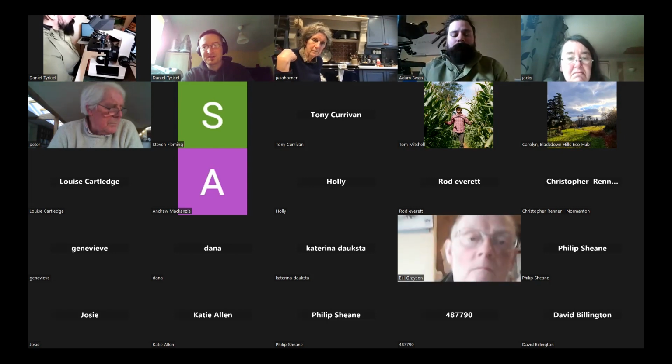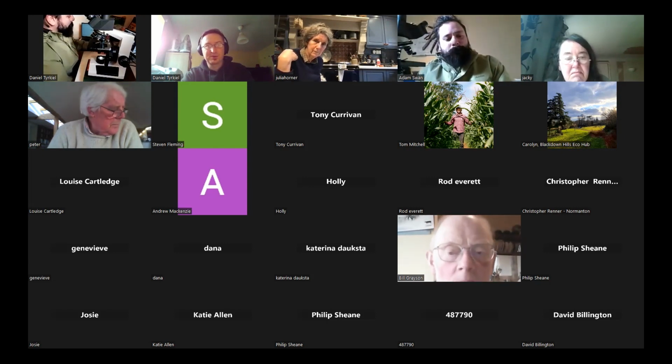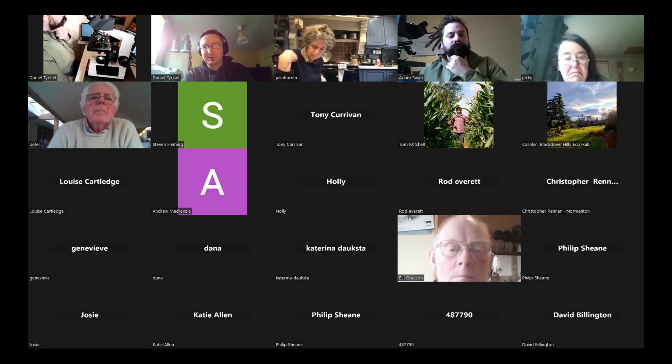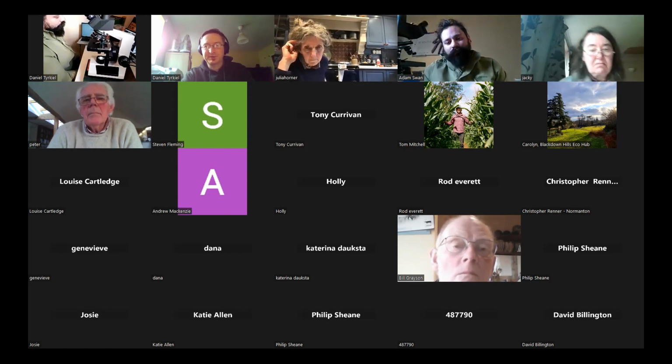Just basically as a preparation for anybody who is looking to learn the microscope. If you email me, I can send you some links to products that you can use for your little lab setup. I'll just share my screen very quickly.